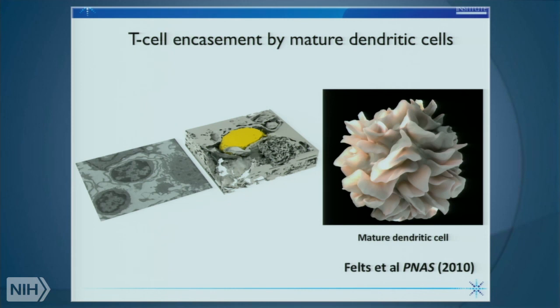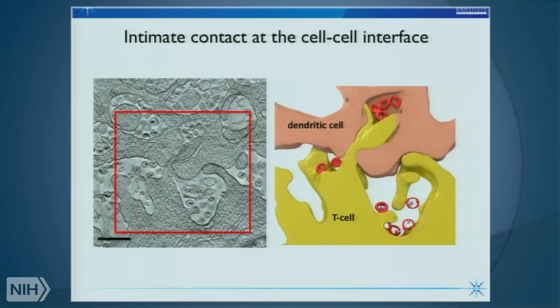And this led to this picture that some of you may recall. This was used in the Research Festival a couple of years ago. Our image of what these dendritic cells look like evolved very quickly, to where we could look at them in terms of huge sheets of membranes coming out. And there were further surprises, because we were then able to show that not only was this contact zone covered by sheets of membranes, but the paradigm that we had in our mind for how viruses were transmitted to cells was very different.